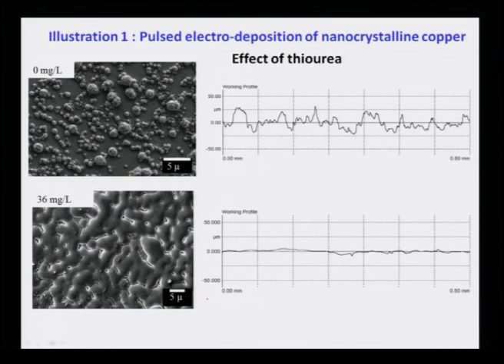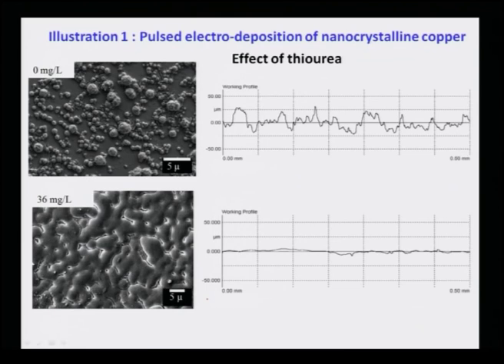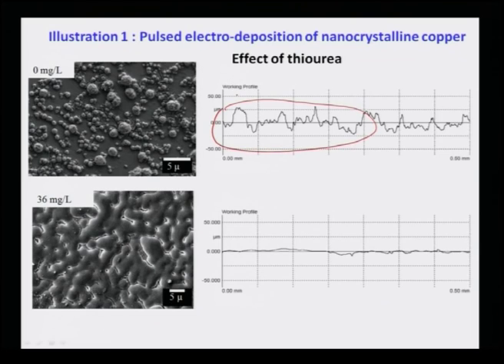I will show two SEM images of thin films deposited on stainless steel substrate. The first, deposited without thiourea, shows very discontinuous deposits, and using a laser scanning profilometer one can measure the roughness — the mean roughness can be over several tens of microns. On the other hand, with just 36 mg/L of thiourea added, the deposits become very smooth.